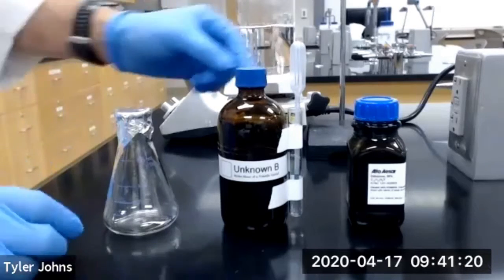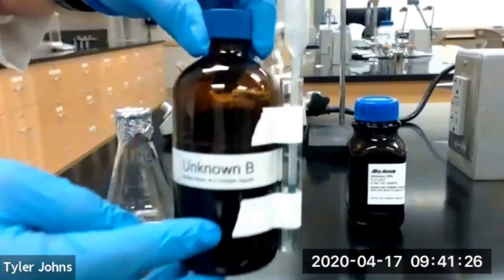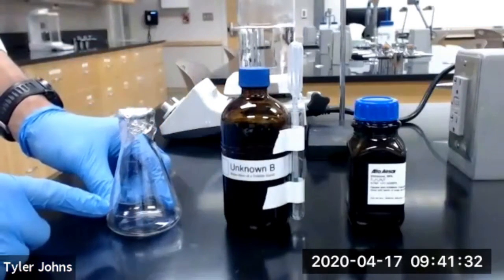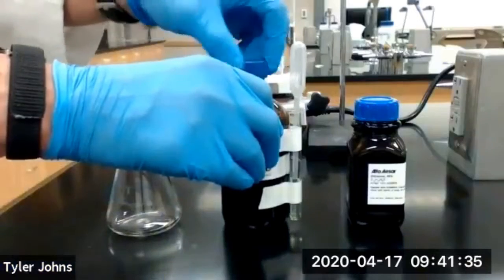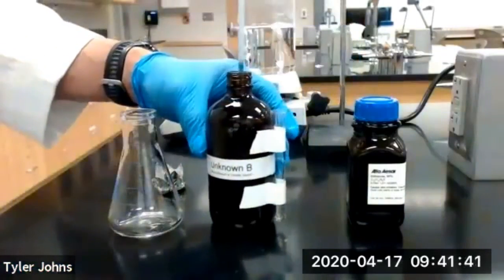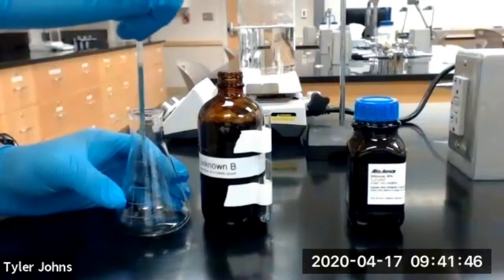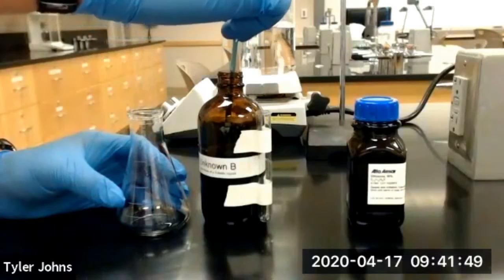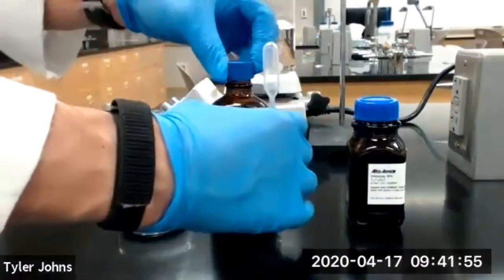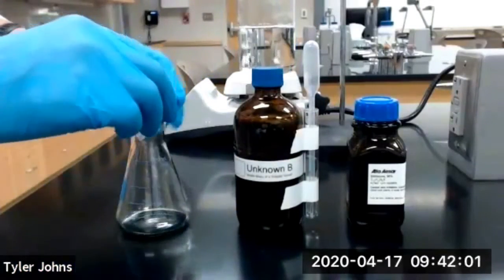The next thing we're going to do is measure about two to three milliliters of our unknown volatile liquid. We're going to be using unknown B, into our 125 mL Erlenmeyer flask. We'll put our foil lid back on.